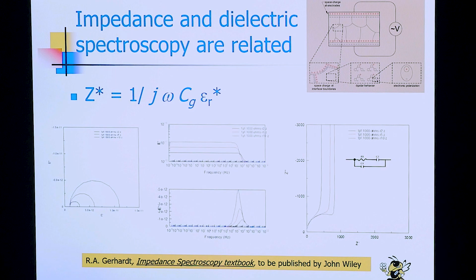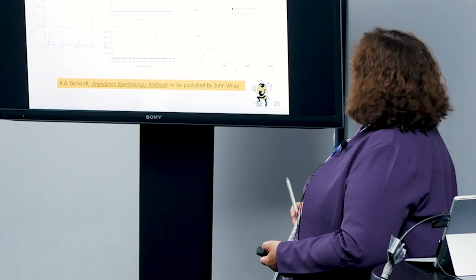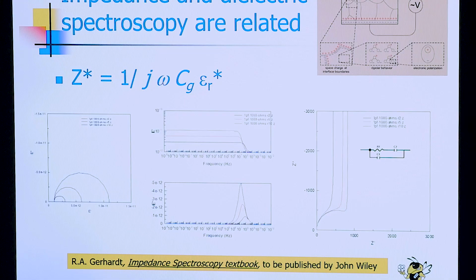And this is, of course, accompanied by a real sigmoidal-shaped curve and a peaked function in the imaginary permittivity or dielectric constant. Now, I am also including the value of the complex impedance here, and you can see that as you change the ratio, in some cases, you don't really see a clearly defined impedance semicircle, but in others, you do, like in this blue case.